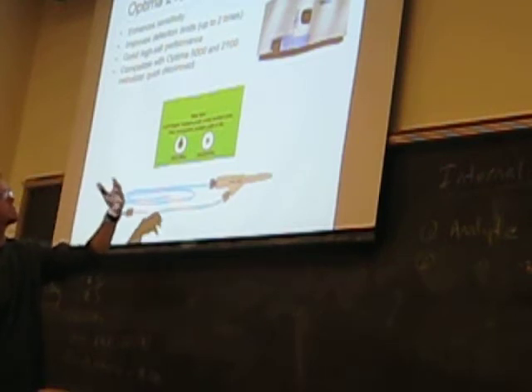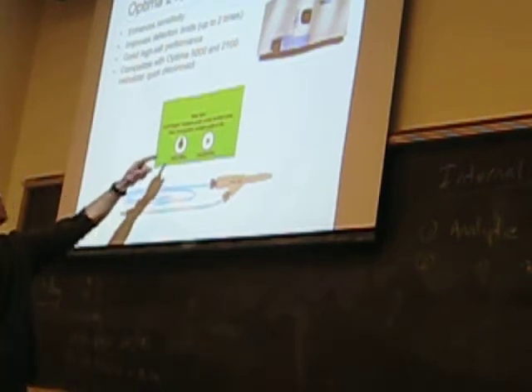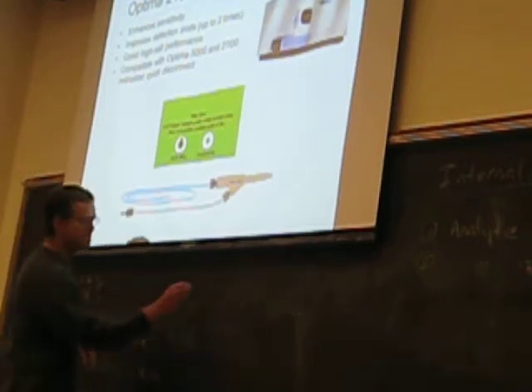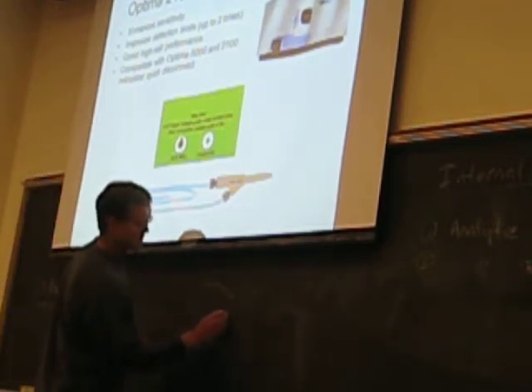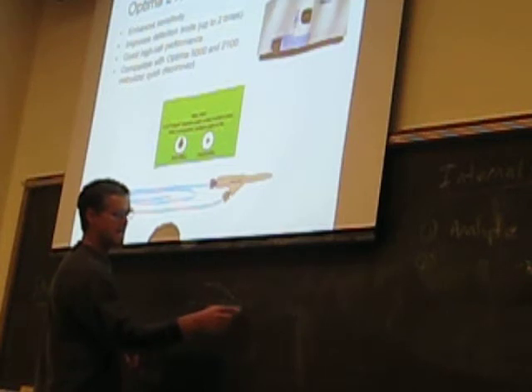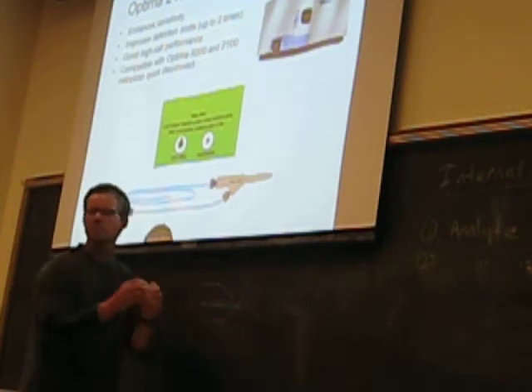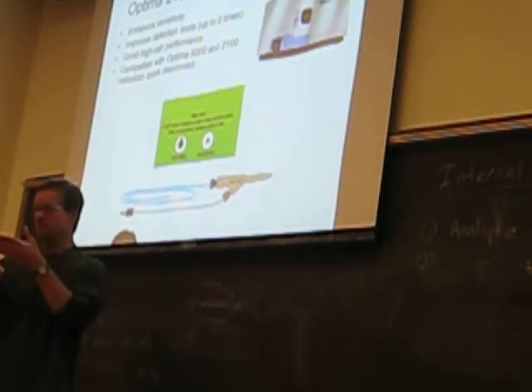And they've got multiple generations of this. And the idea is that when you look at nebulizers, it seems like such a simple thing. But the goal of a nebulizer is to take your liquid and have it be aerosolized into very small droplets. And so on one hand, the way to do that is to have a nebulizer that has a really fine tip. So when you have your sample coming in here, the finer this tip, meaning the smaller that diameter, the greater the flow of gas coming out of that, and it creates more turbulence here that creates finer droplets of your sample. That's good. That's what you want.